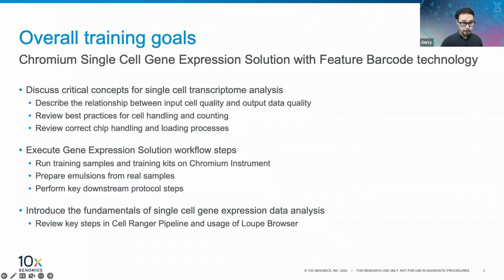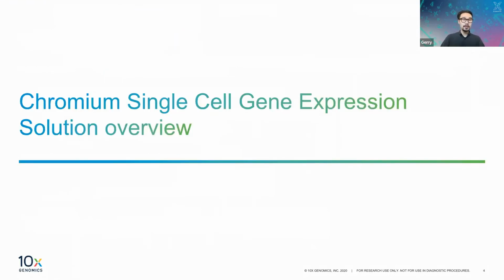presentation next week. We'll also talk about executing the gene expression workflow steps. This is mainly going to be talked about next week, but we'll touch on some of the key points briefly today. And we'll also introduce the fundamentals of gene expression data analysis, reviewing key steps in Cell Ranger and the usage of Loupe Browser. But today it's going to be mainly this first portion. Okay, so I'll get straight into it.